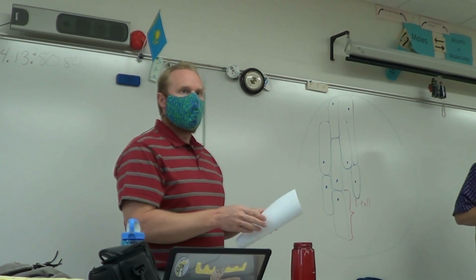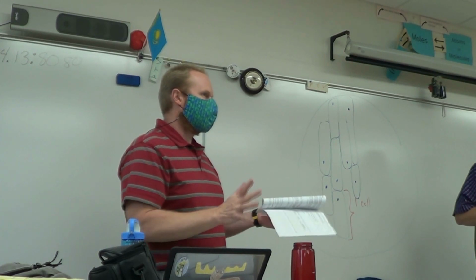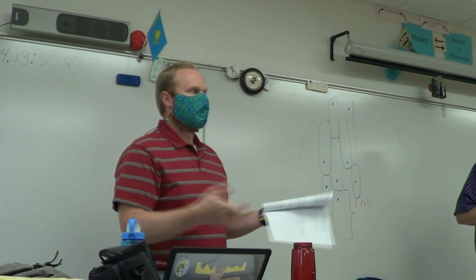In between, a simple rinse of your cover slip and your slide should be sufficient. If you choose to dry off your cover slip, be careful because they're really, really thin and they break really, really easy. So be careful of that.